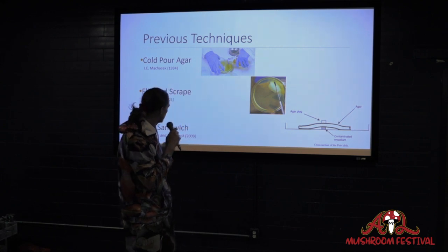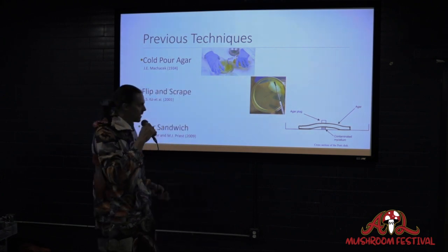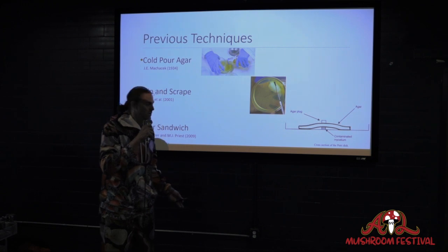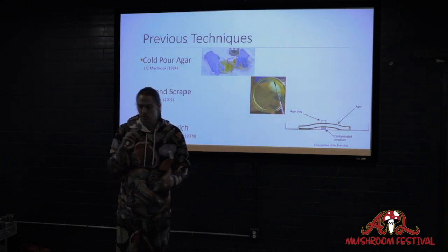So this plug, in theory, should be clean. And so this was a technique that's been used since 2009, and a lot of people have had great success with it. But the obvious downfall here is that you just need a lot of agar. You need a lot of plates. It's just kind of a little bit more complicated than what most people are trying to do.